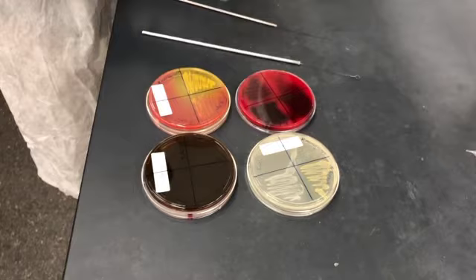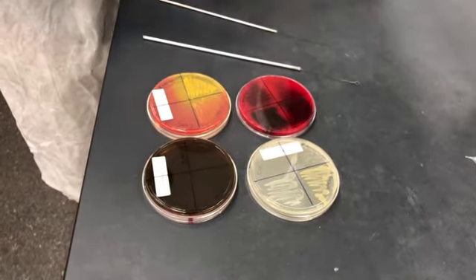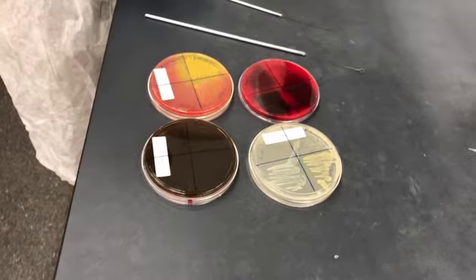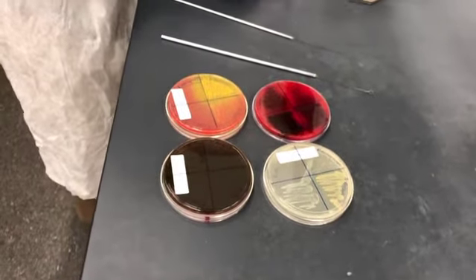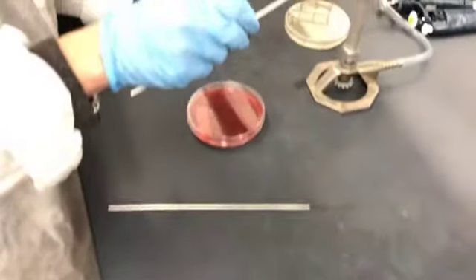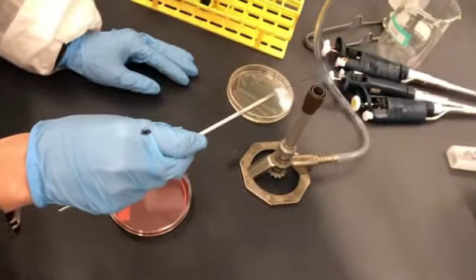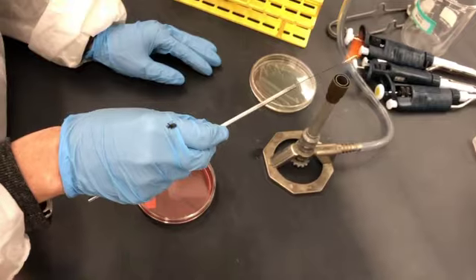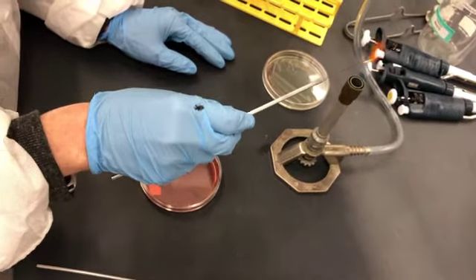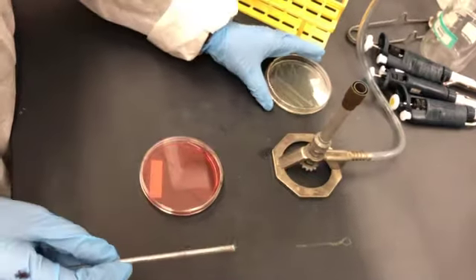So first, we're going to make a quadrant, labeled quadrant on the bottom, where you label each of the bacteria you plan to use. This is our mannitol salt plate. We are then going to use our loop, and we're not going to be conducting a streak plate technique. Instead, we want to have a small zigzag. I like to start from the outside and move my way in.